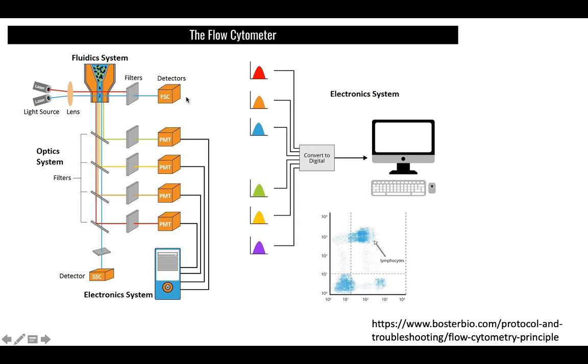So what exactly happens here is you get all the data. Once the cell goes in through the tube, the laser shoots whatever light it is, and the filters allow certain wavelengths to pass, certain not to pass. And when these lights hit the cell, they refract the rays, and the detector detects the ray and converts it into a digital format, which then gets converted into something of this sort. There's a lot of mathematics involved here, and I'm just afraid of it.